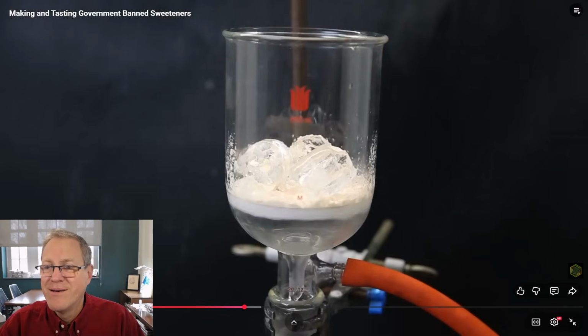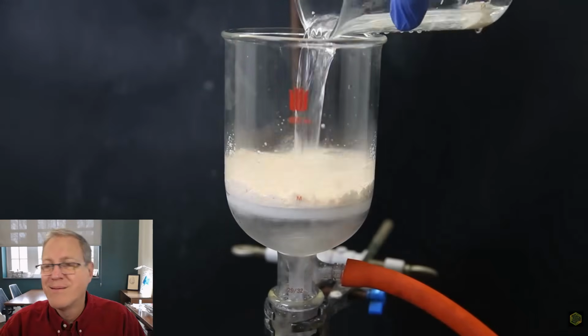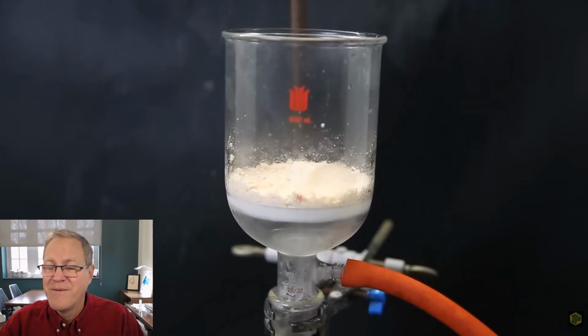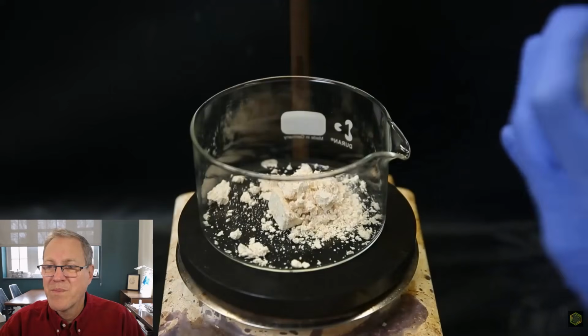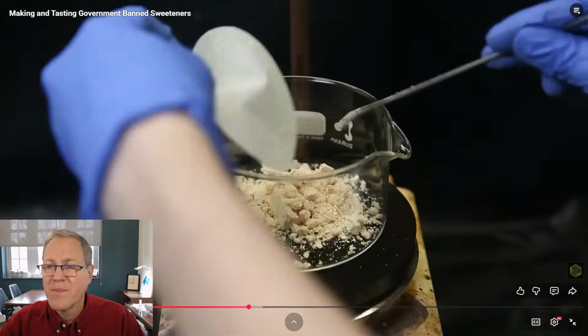I set it up for vacuum filtration to filter out the product. I remove the remaining ice and wash it with more water. I leave it to dry for a second and then move it all to a dish again. The result is a slightly yellow powder, but to purify it, I will recrystallize it.